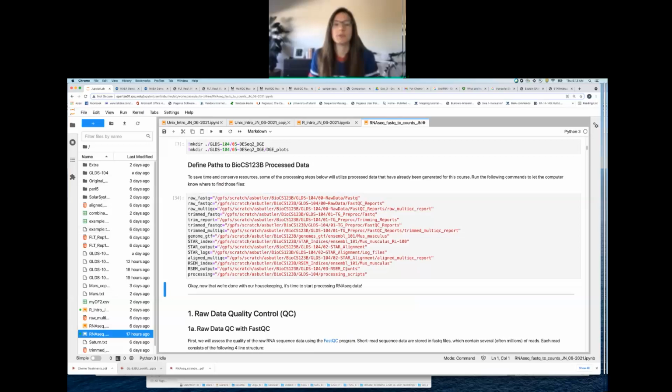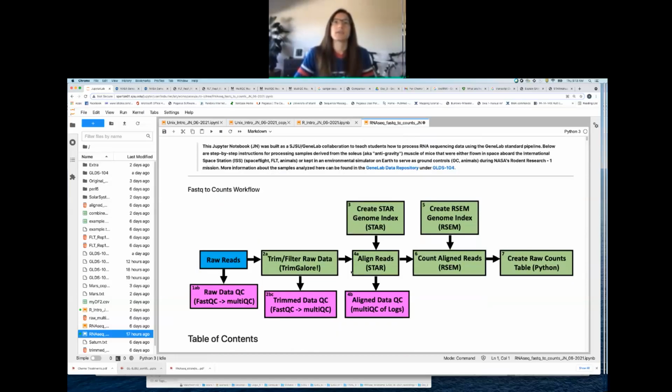Was there anyone who wasn't able to do that? Oh, and I do want to make sure too, can everyone look down here on their Jupyter Notebook and make sure that they have the Python 3 idle? And if you don't, put a message in the chat. Okay.